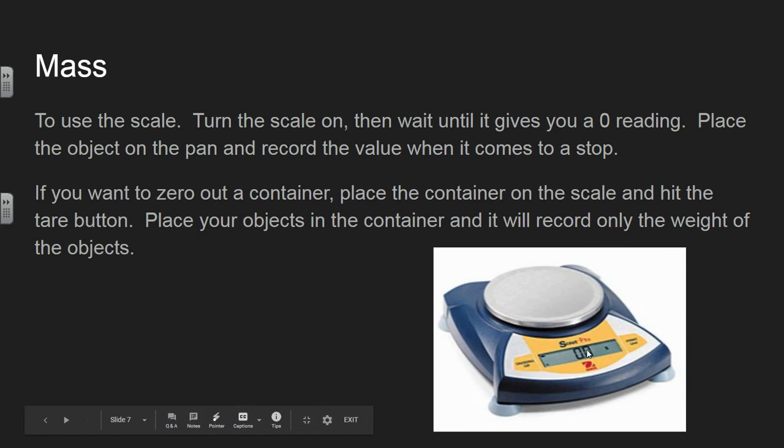Now, another good way that a scale is very useful is it has a zero button. And so a zero or a tare button on the side allows us to place a container on the scale, zero or tare out that container, and then place an object in the container and get the mass. This is great for a liquid or some object like maybe a chemical that you don't want to put directly onto the scale pan itself. So if you're measuring a liquid, you might put a beaker onto the scale, zero or tare the beaker, pour the liquid in, and then you have the mass of just the liquid.